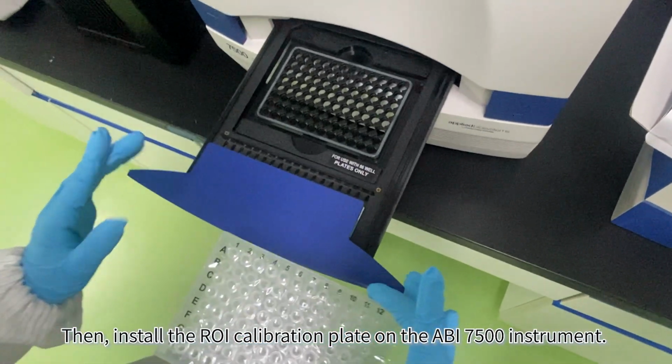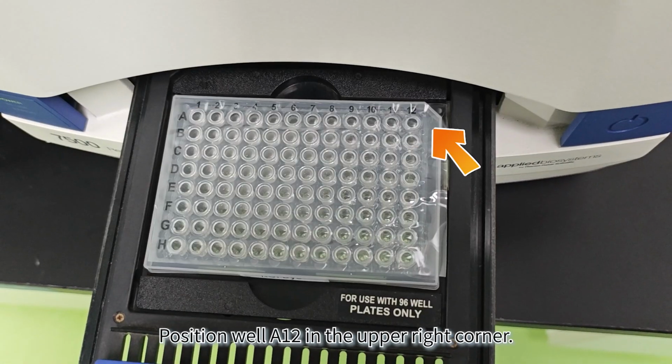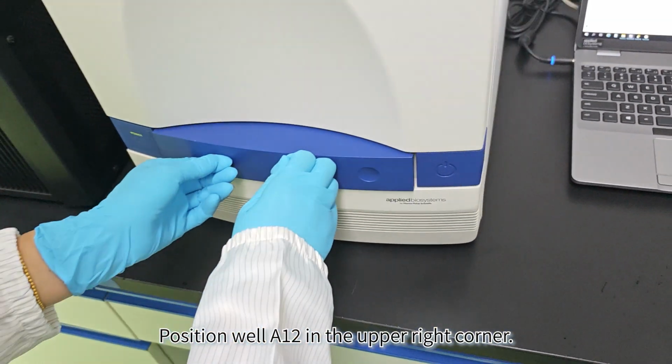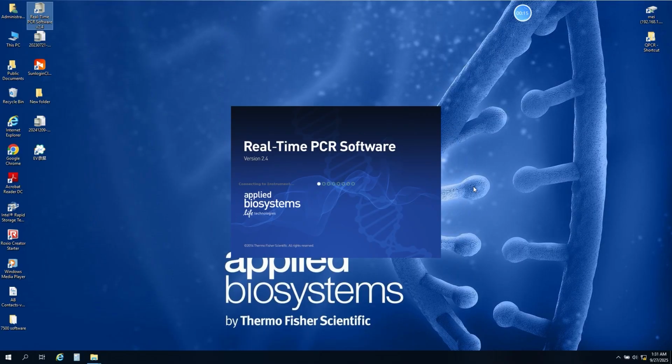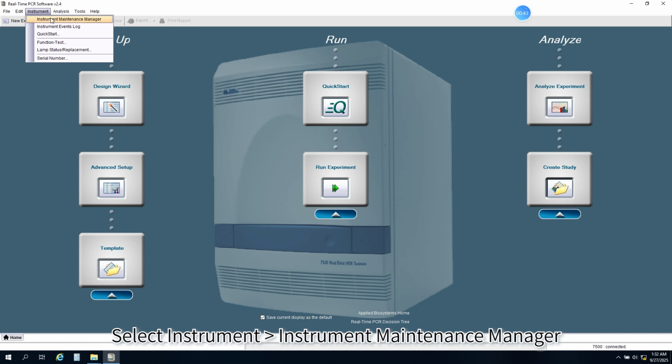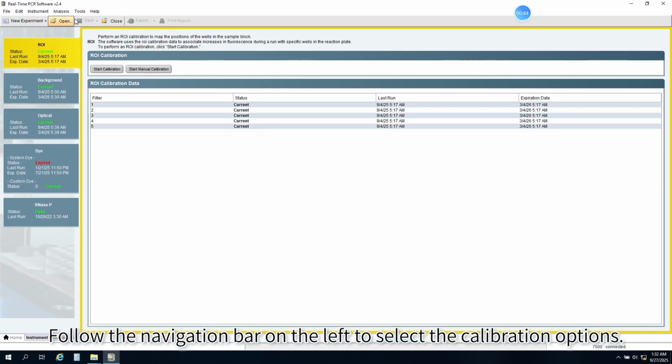Then, install the ROI calibration plate on the ABI 7500 instrument. Position well A12 in the upper right corner. Open the software and begin calibration. Select Instrument Maintenance Manager to enter the calibration interface. Follow the navigation bar on the left to select the calibration options.